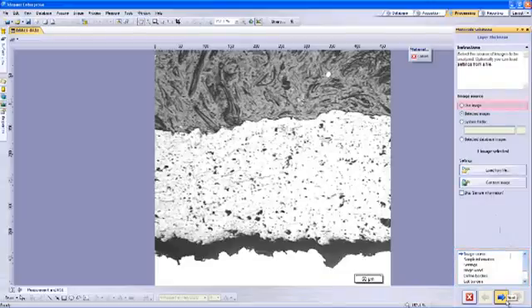The image source selection can be from a new live image, the selected image already open within the software, a batch of images located within a system folder, or a batch of images you select within the optional Olympus Stream database. The ability to process multiple images as a batch will increase workflow and productivity, also allowing you to average data over a group of images associated with a single sample.